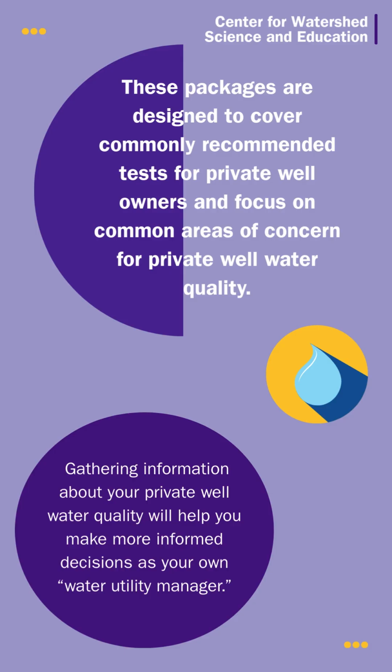While these instructions are designed to evaluate your well water system, such as untreated well water, you may choose to sample different faucets if you are evaluating a water treatment system.